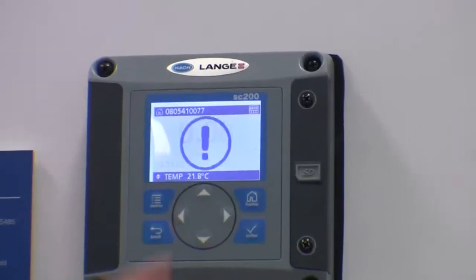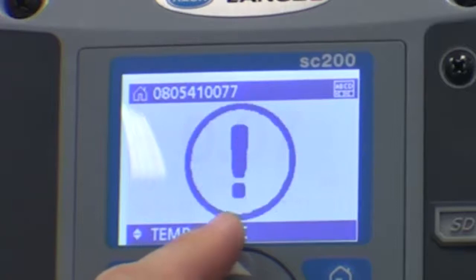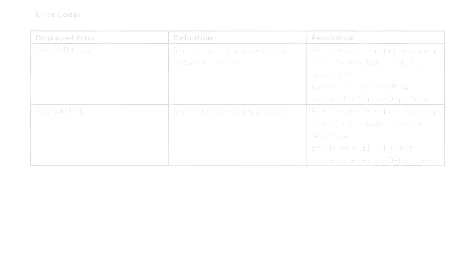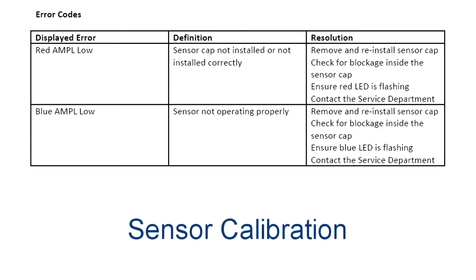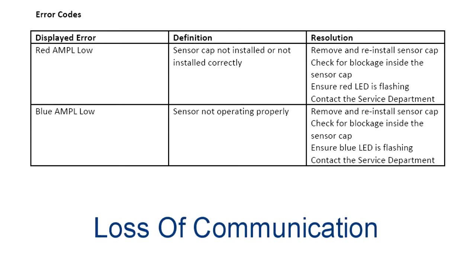If any errors or warnings are present on the LDO, this display will show the large exclamation mark intermittently flashing with the reading, which also displays the smaller exclamation mark inside the triangle. Possible sensor errors will be displayed by the SC controller. The following conditions will cause a sensor error: sensor calibration, relay timer washing cycle, or loss of communication.